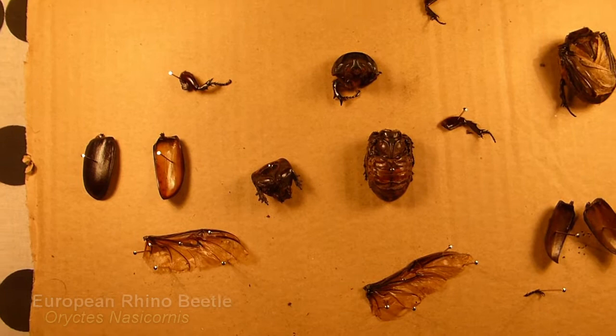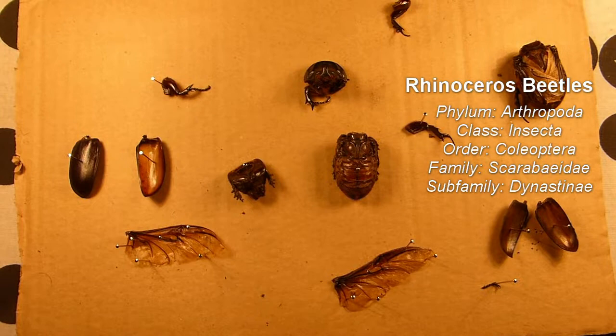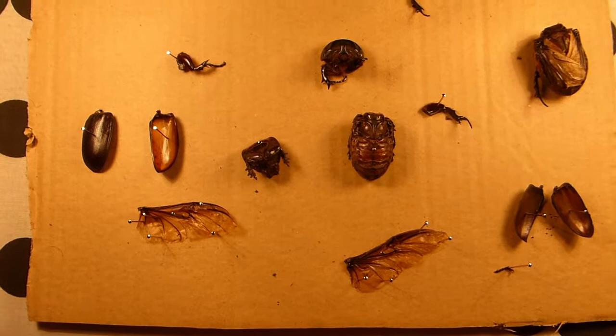These are beetles from Dynastinae, which is itself a part of Coleoptera, Coleoptera being the overarching term for all beetles. There are about 400,000 species of beetle, which equates to 40% of all insects and about 25% of all animal species.